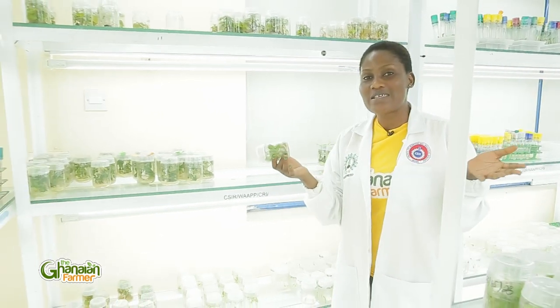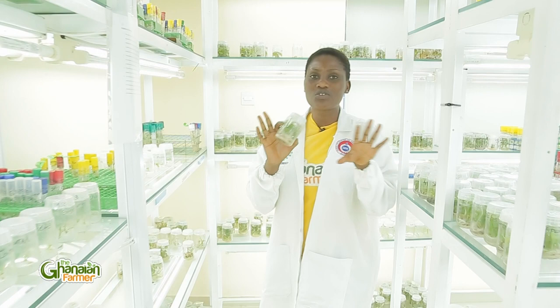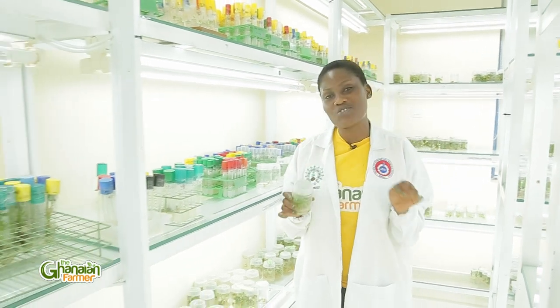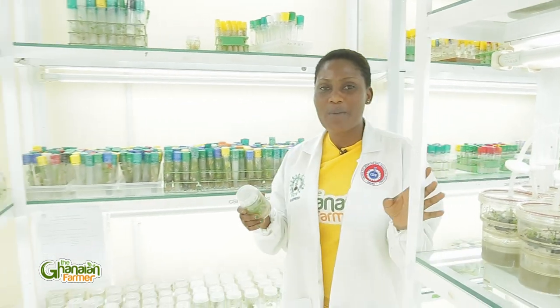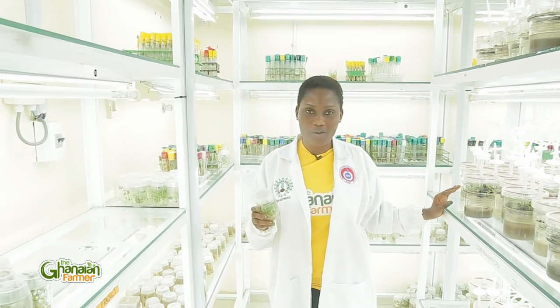How do you get the vines that you actually grow in your farms? It goes through a lot of stages, and the very first or baby stage it goes through has to do with tissue culturing. That is what we are here to find out more about — to educate our farmers about what it means in agriculture.